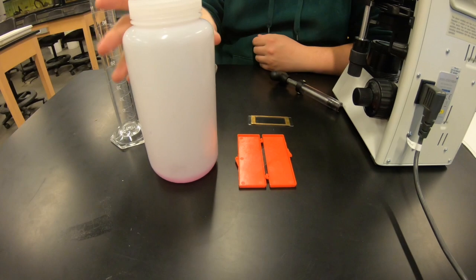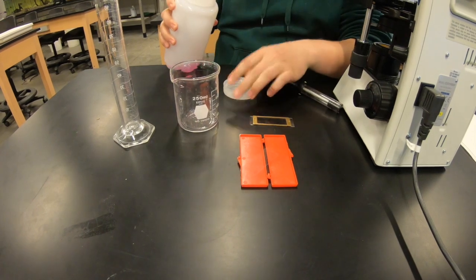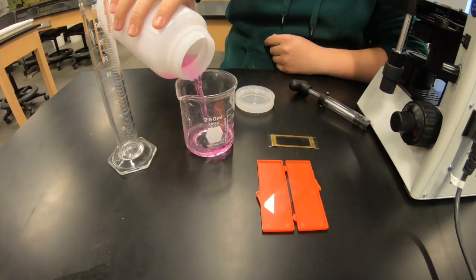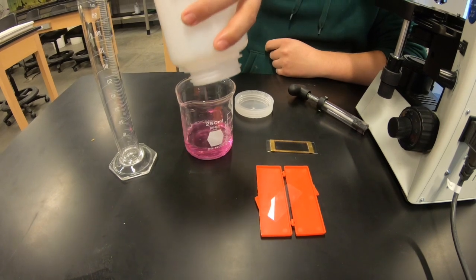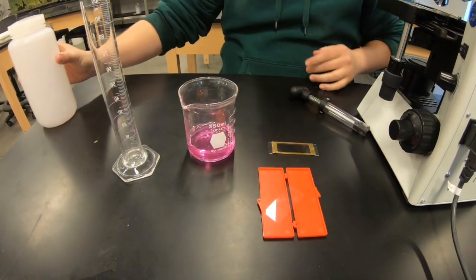So now we're going to determine the standing crop biomass of plankton. Once you get back into the lab, you're going to take your sample jar and pour it into a beaker.